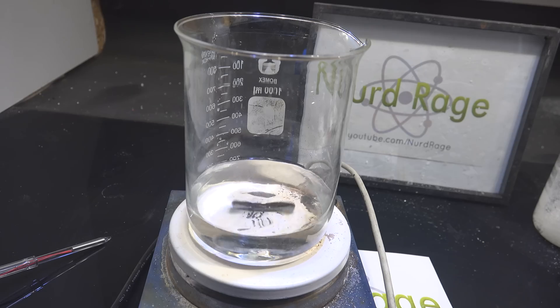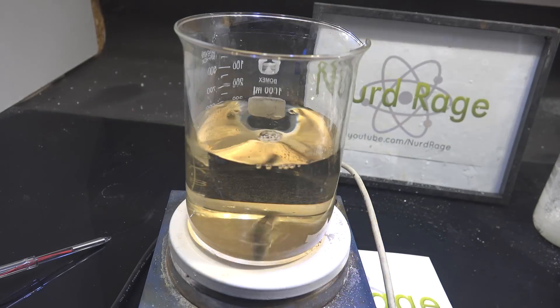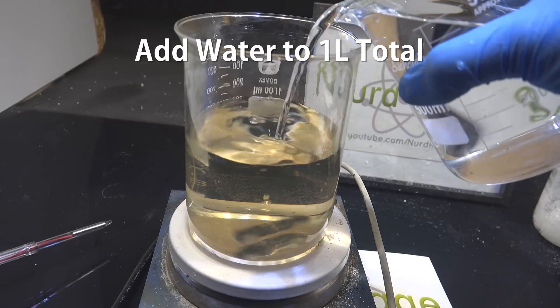After everything is dissolved, we now add more water along with the copper sulfate solution we had earlier. Then we top up with enough water to about 1L of total volume.